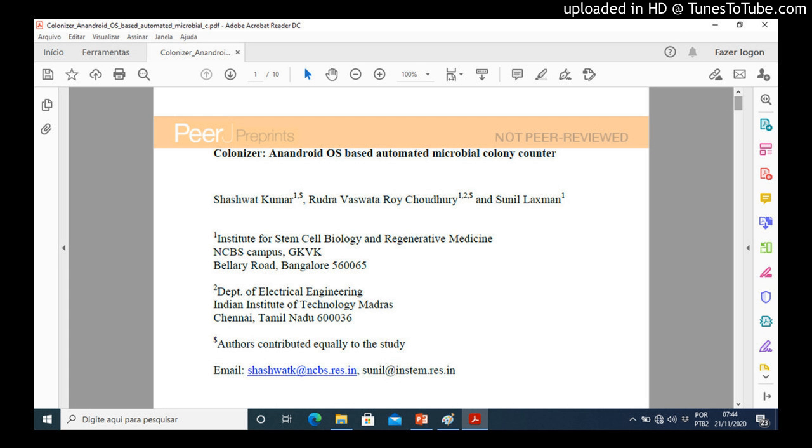The accuracy was subject to the image acquisition method used. A mean accuracy was observed, respectively, for images taken within a laminar hood, images taken using a cardboard box setup, and images taken under bench ambient light, respectively.